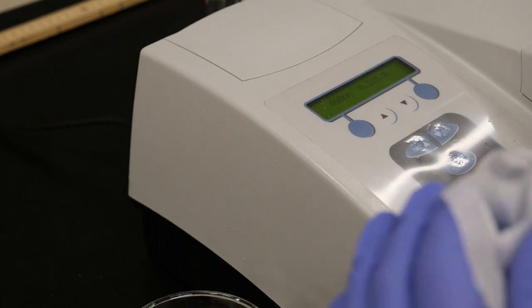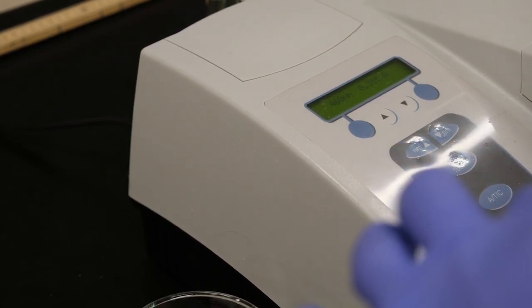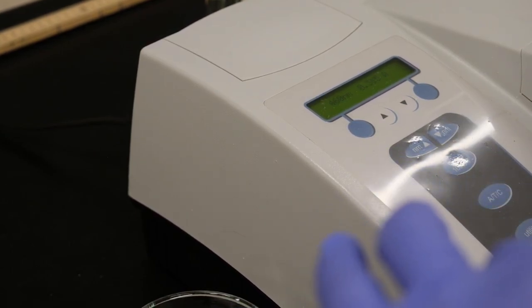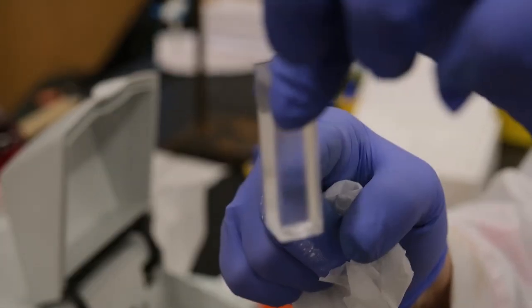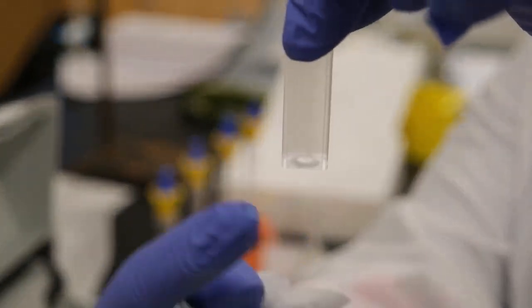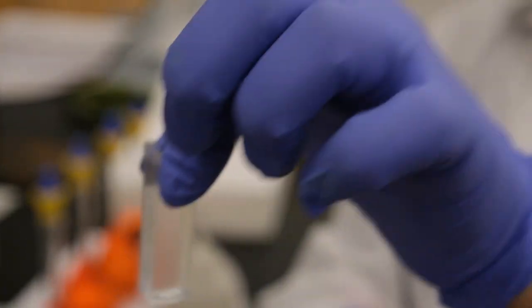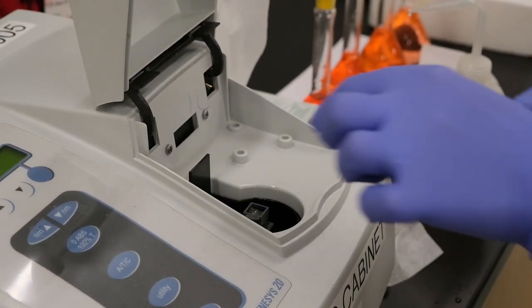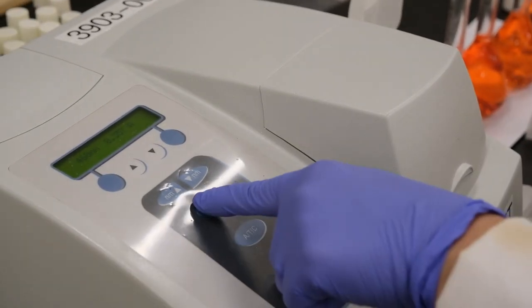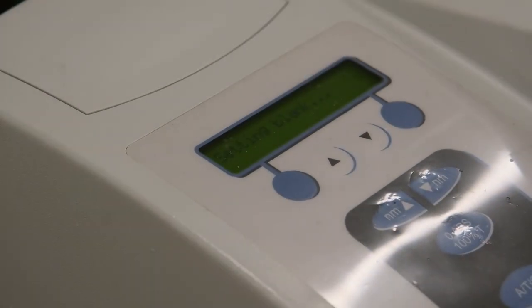Clean the side, because the grease of your hands, or the dirt on your gloves, might affect the reading. Point the clear side, you see that there are an opaque side and a clear side. You point the clear side towards the laser, like this, and you zero your system.